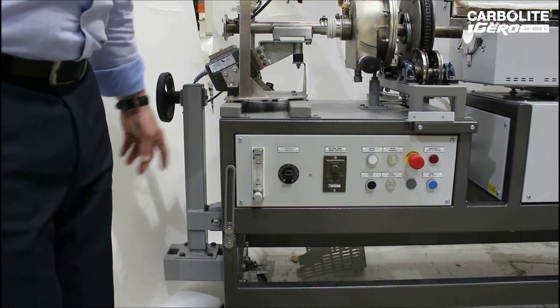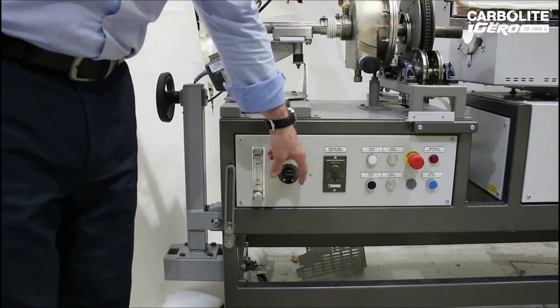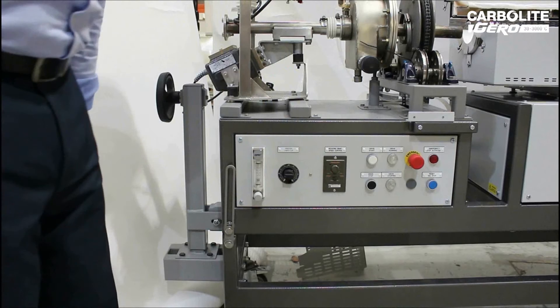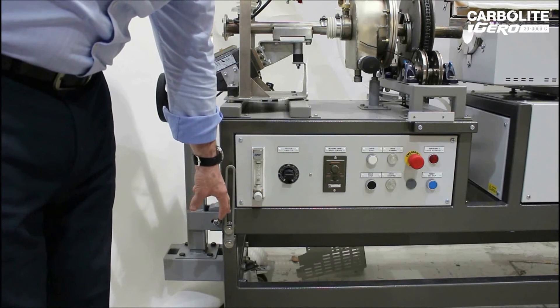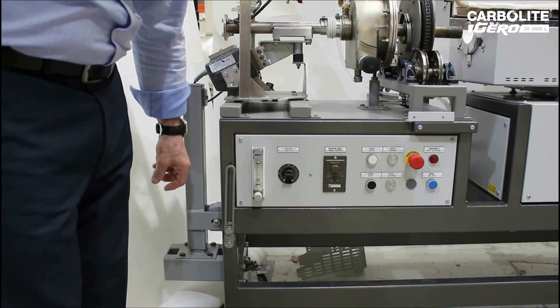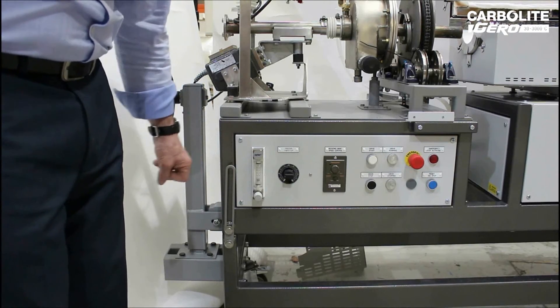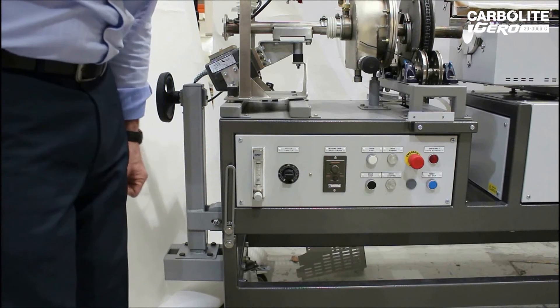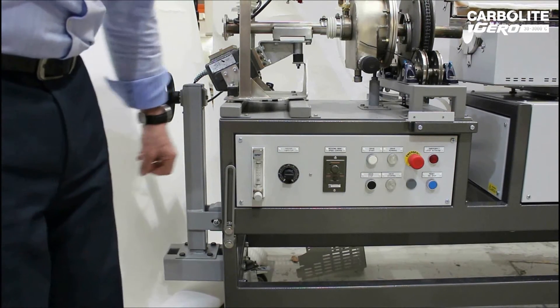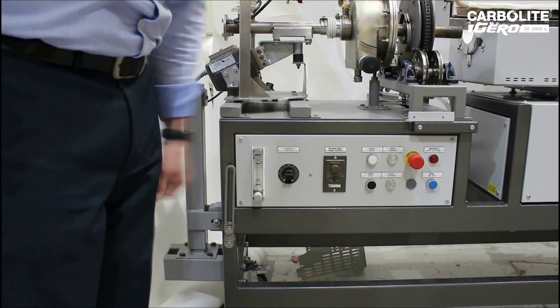Throughput of product through the furnace is controlled by a combination of the drive speed and angle of inclination. The typical angle for the furnace is normally 2 degrees, but the range of the angle is from 1 to 6 degrees, with a rotational speed between 1 to 10 RPM.